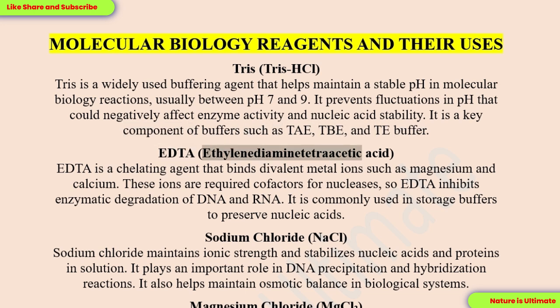EDTA, ethylenediaminetetraacetic acid. EDTA is a chelating agent that binds divalent metal ions such as magnesium and calcium. These ions are required cofactors for nucleases, so EDTA inhibits enzymatic degradation of DNA and RNA. It is commonly used in storage buffers to preserve nucleic acids.